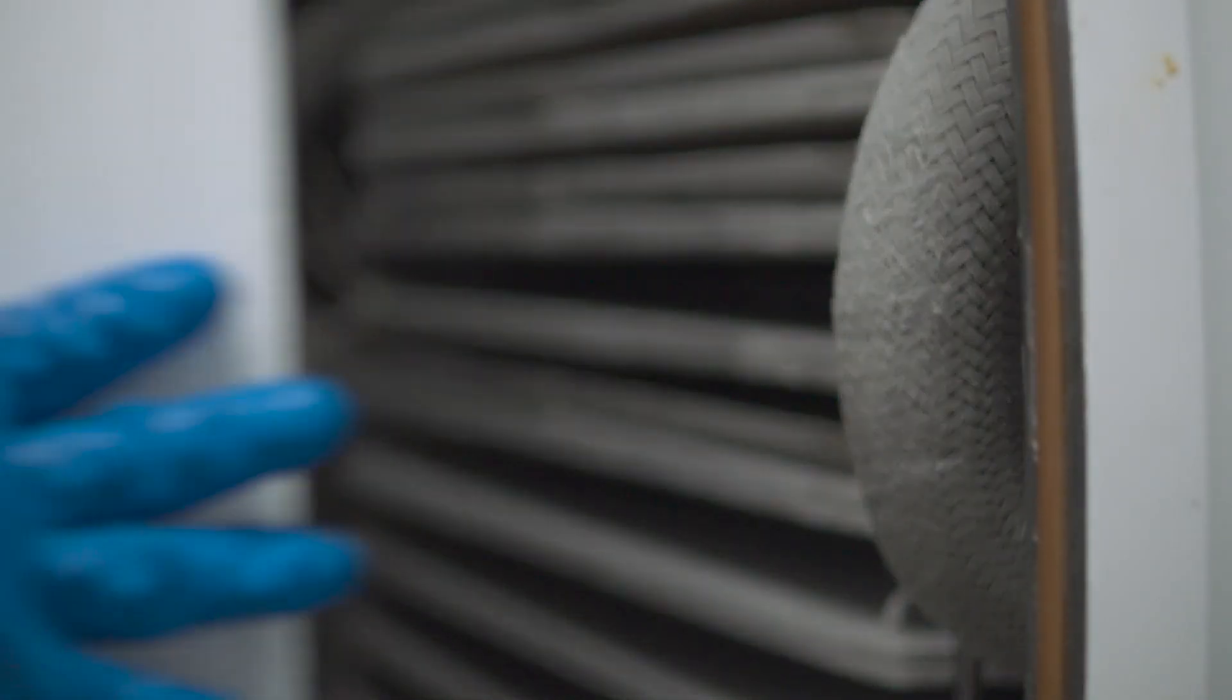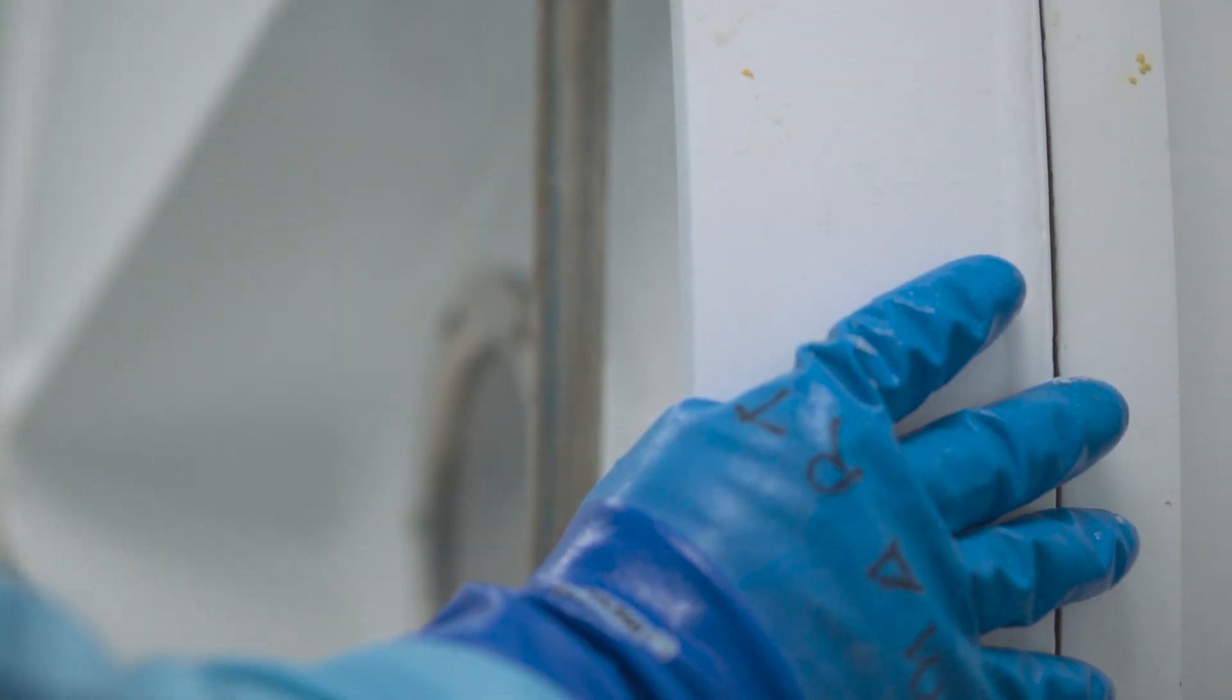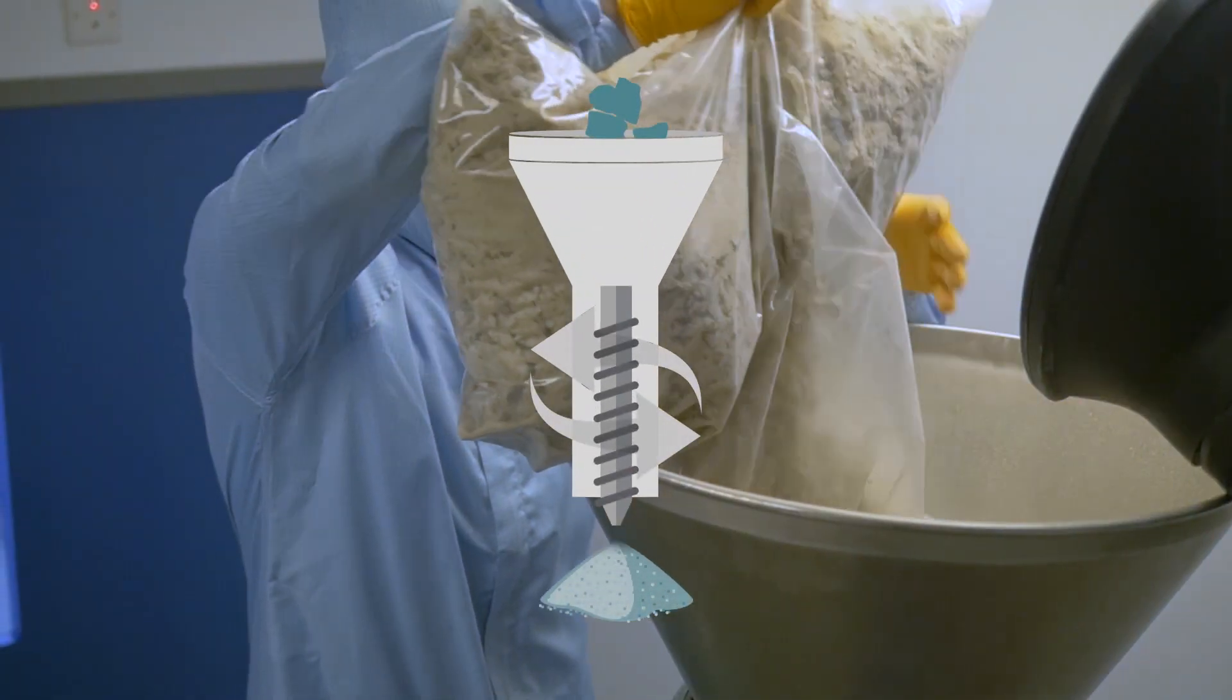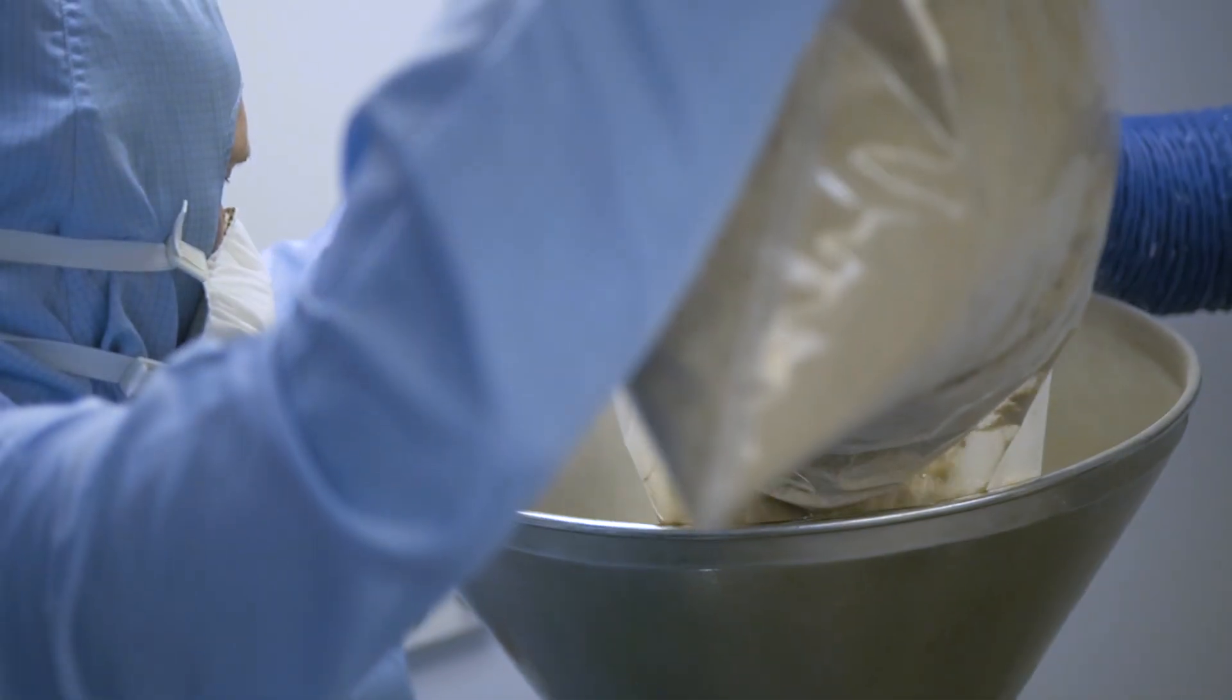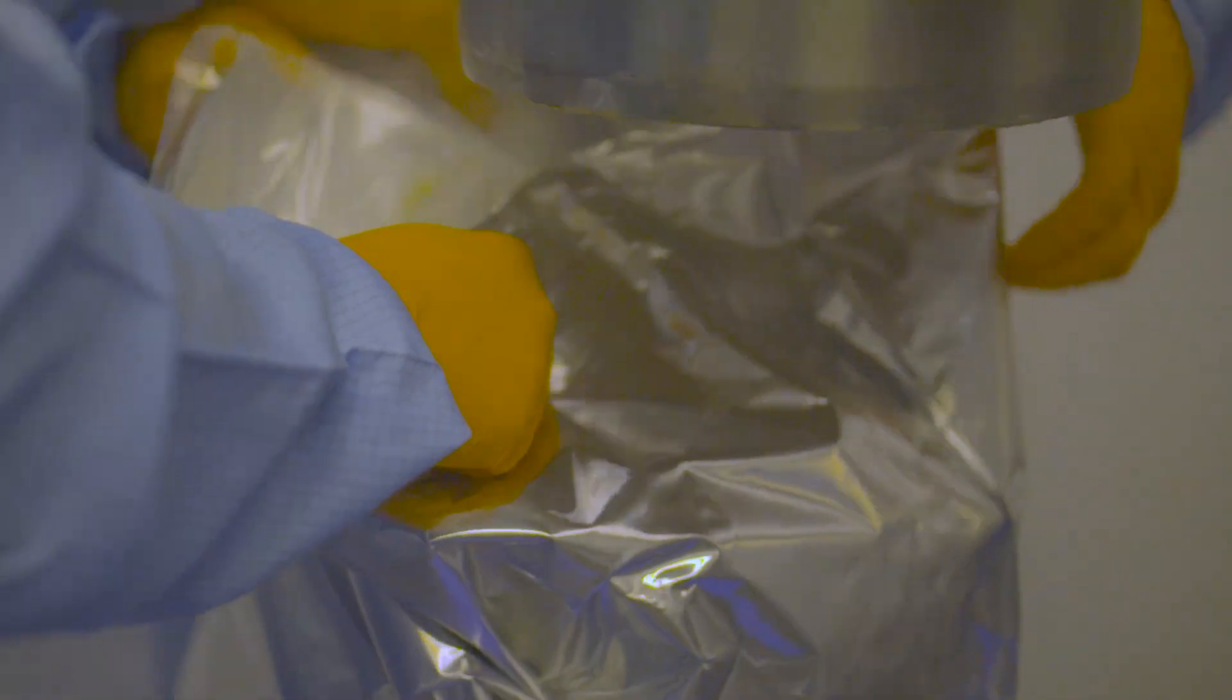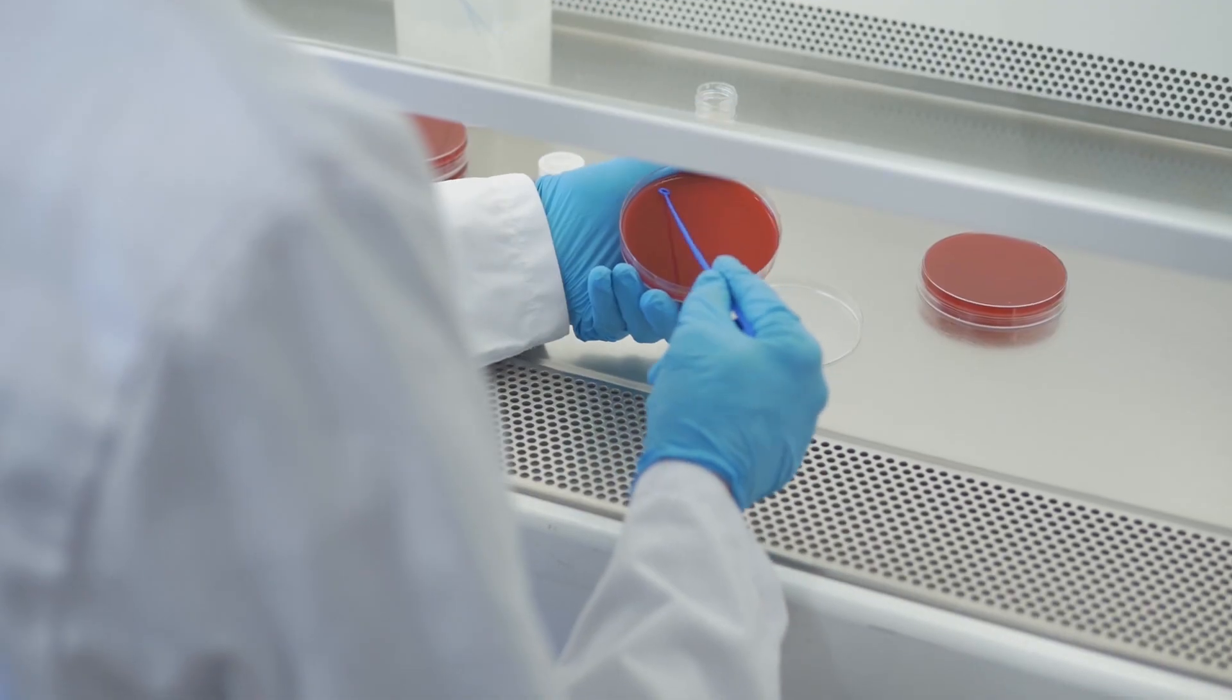The dried material takes the form of a honeycomb structure and this is milled into a fine powder which will be used to formulate the final product. The milled powder is then tested in the lab to check viability and quality.